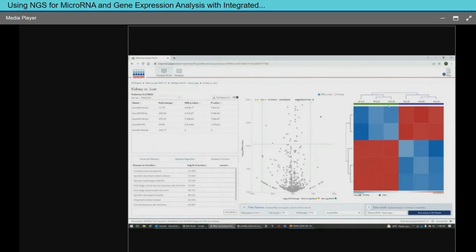So if we wanted to differentiate between the green and the purple samples here, we have two microRNAs that are low expressed in one and high expressed in the other, and we have a couple of microRNAs down here that are reversed, which, if we run more samples, may actually be a nice little panel that we could use.